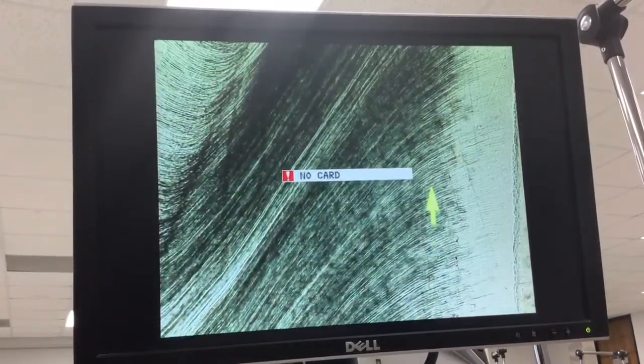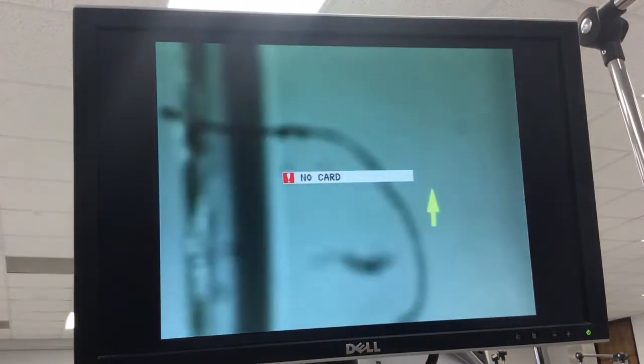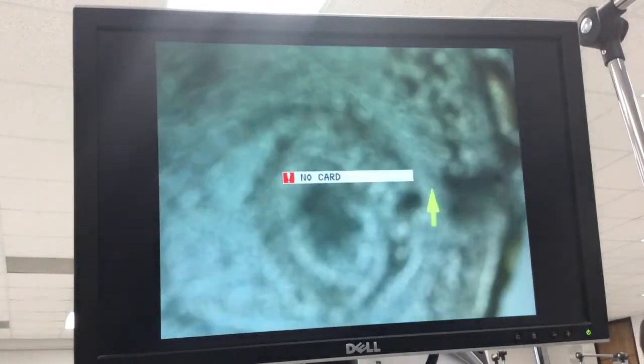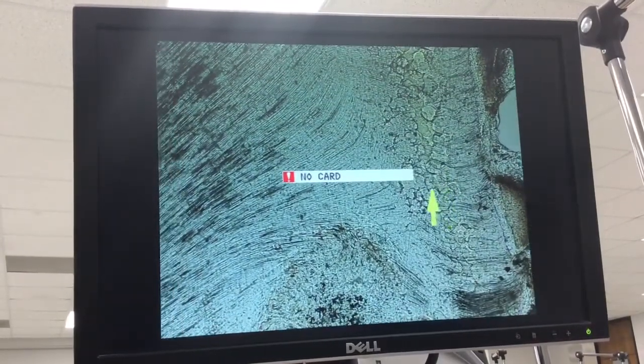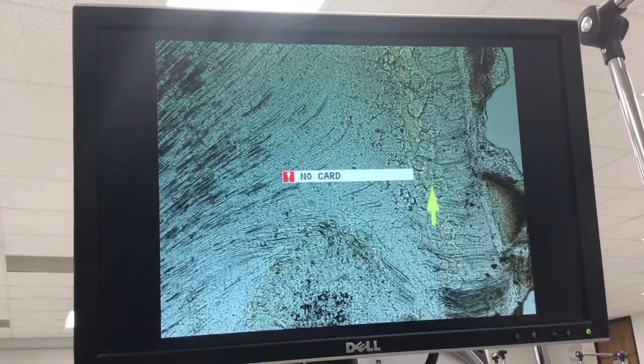And normally you find these in the circumpulpal dentin up in the crown. Sometimes, but not very often, down in the root. So we have all of those structures. There's the DEJ again. And we'll take a look at one other slide. And this particular slide is a little bit unusual. Here you can see both the globular dentin and the interglobular dentin in between.